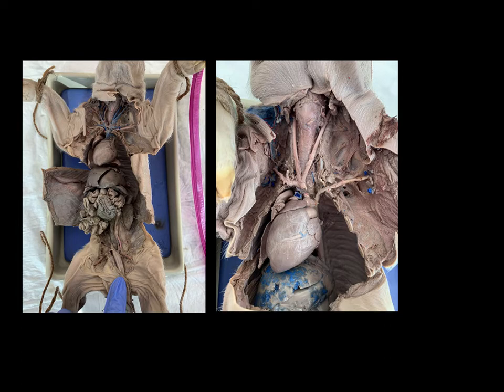This is actually the largest vessel in the entire body. The aorta, it doesn't look very big here, but keep in mind this is a fetal pig. This is the aorta. Specifically, this bent portion is called the arch of the aorta. When you're looking at the big model heart, you do need to know the parts of the aorta, but for the fetal pig, this structure right here is the aorta. Now, right in front of the aorta is something called the pulmonary trunk. So the pulmonary trunk is just immediately in front of the aorta, and here's the aorta.